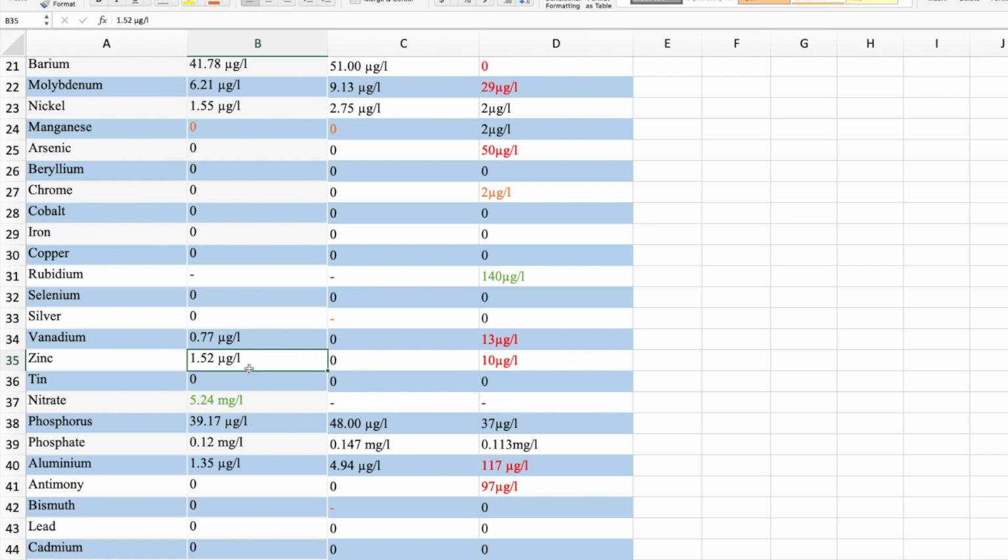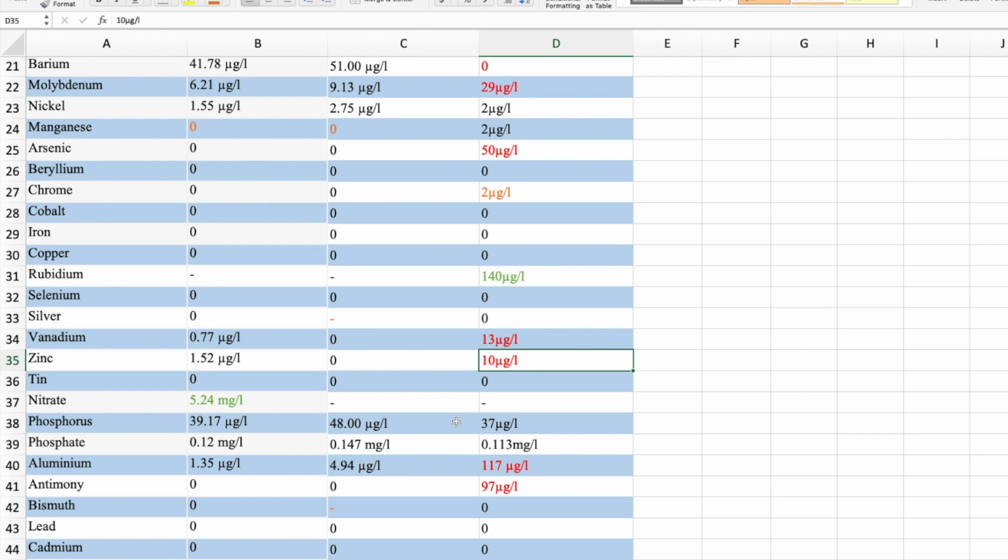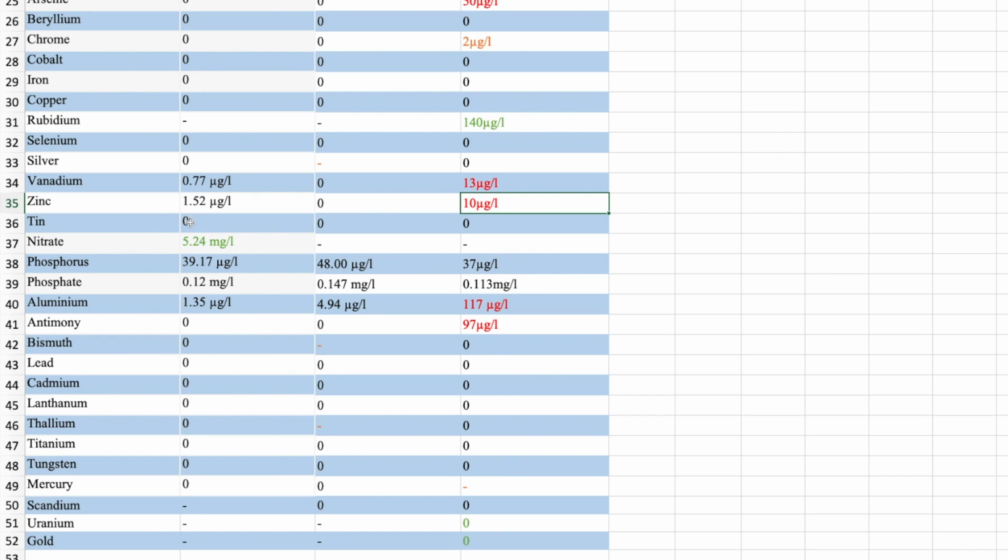Zinc, we had not detected here, a small amount there, and then another fairly large amount there. If I go to the Quantum results, though, because we're talking ppm, they found 0.01, and we're looking for 0.002. When I convert it back to µg/L, it ends up being 10. I'm taking a point off of that because it's a fair variance. Make your own call. All right, moving on to tin, not detected in all three.